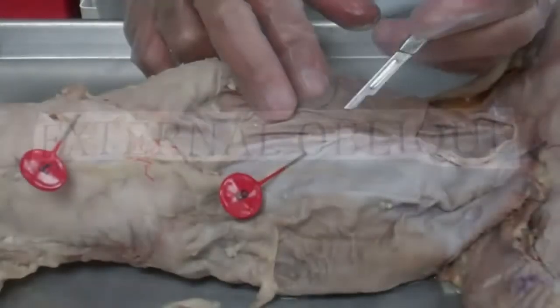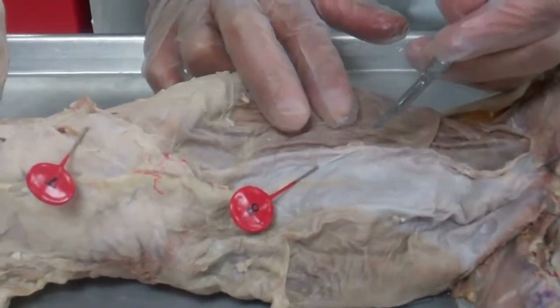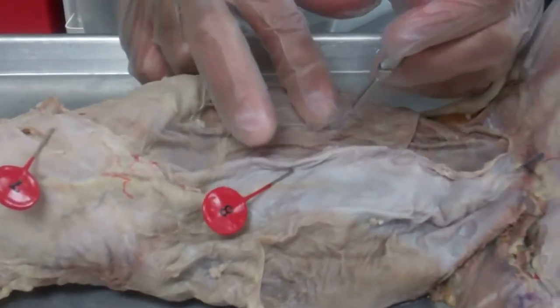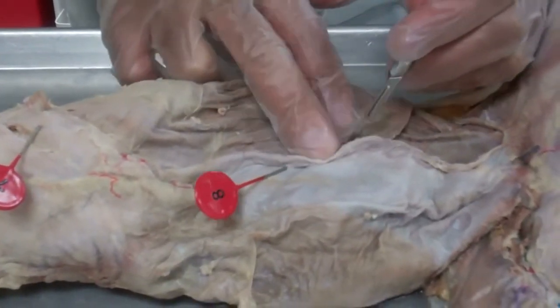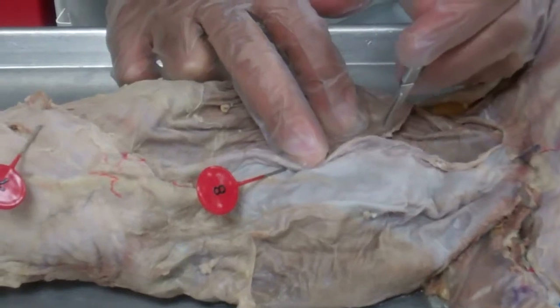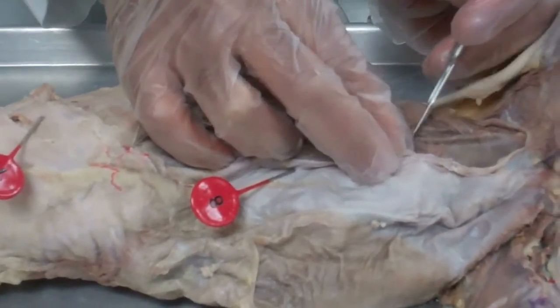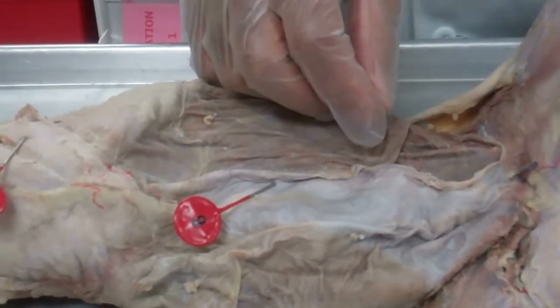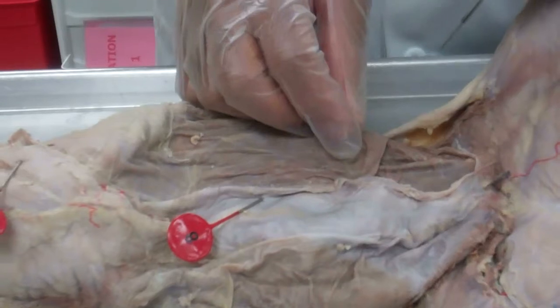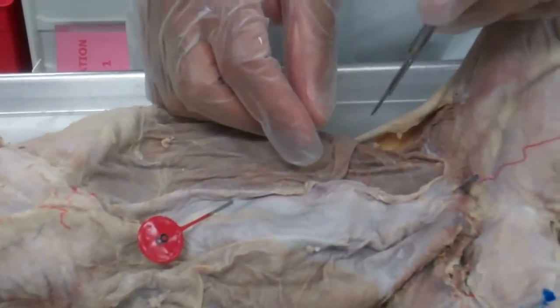External oblique. The next muscle is going to be the external obliques. And what you have to do is you have to follow this fascia line right along here. And with the oblique muscles, you have to be careful not to go too deep. If you go too deep, you'll be into the viscera, which you don't want to do. You want to see the different layers.